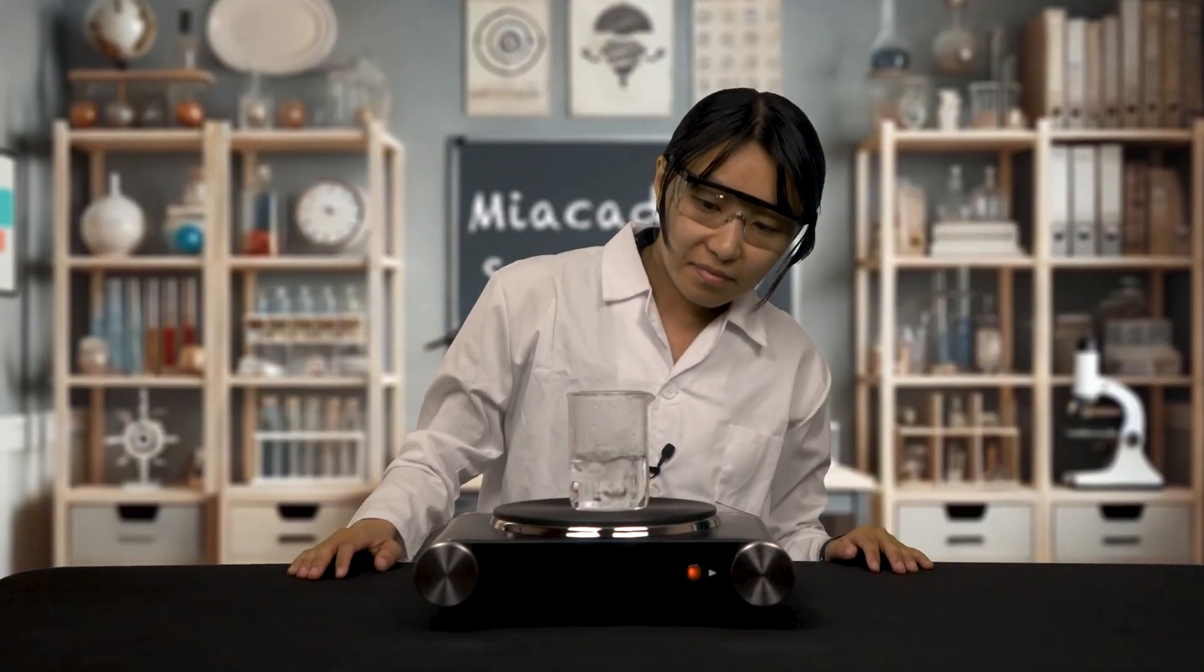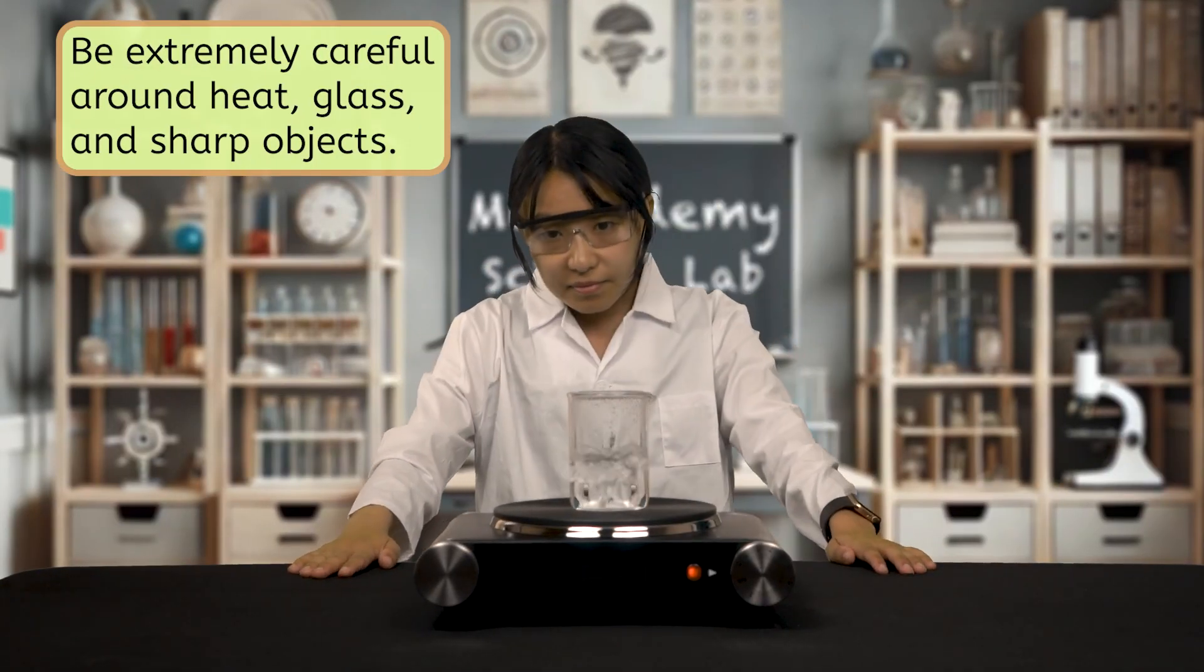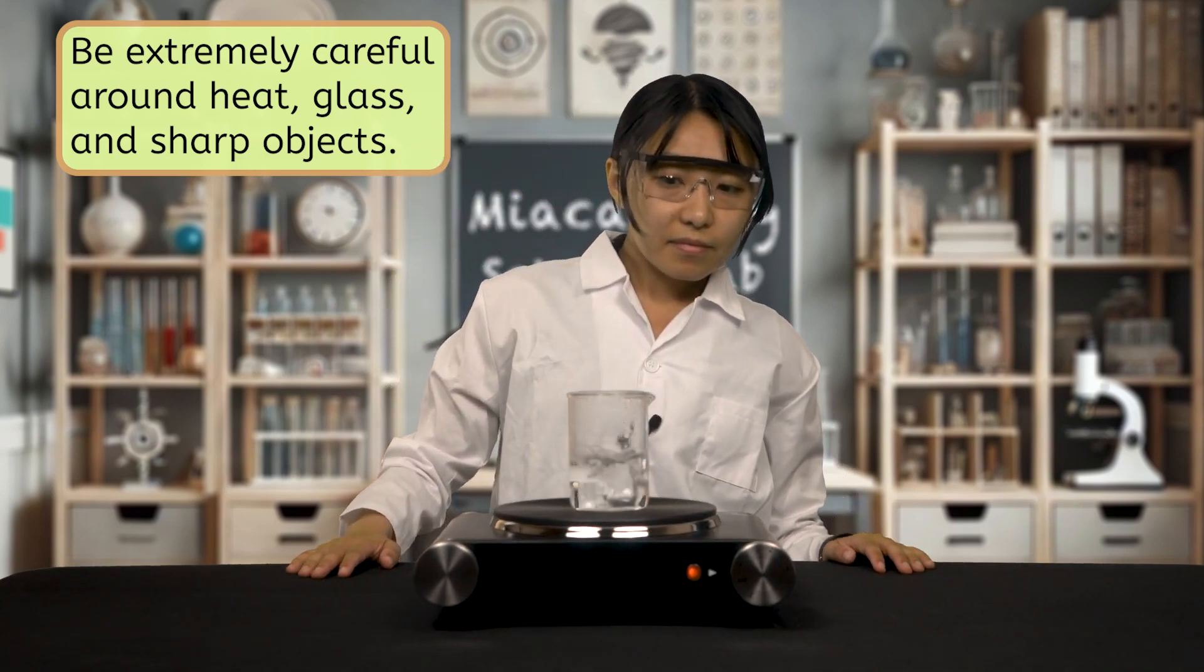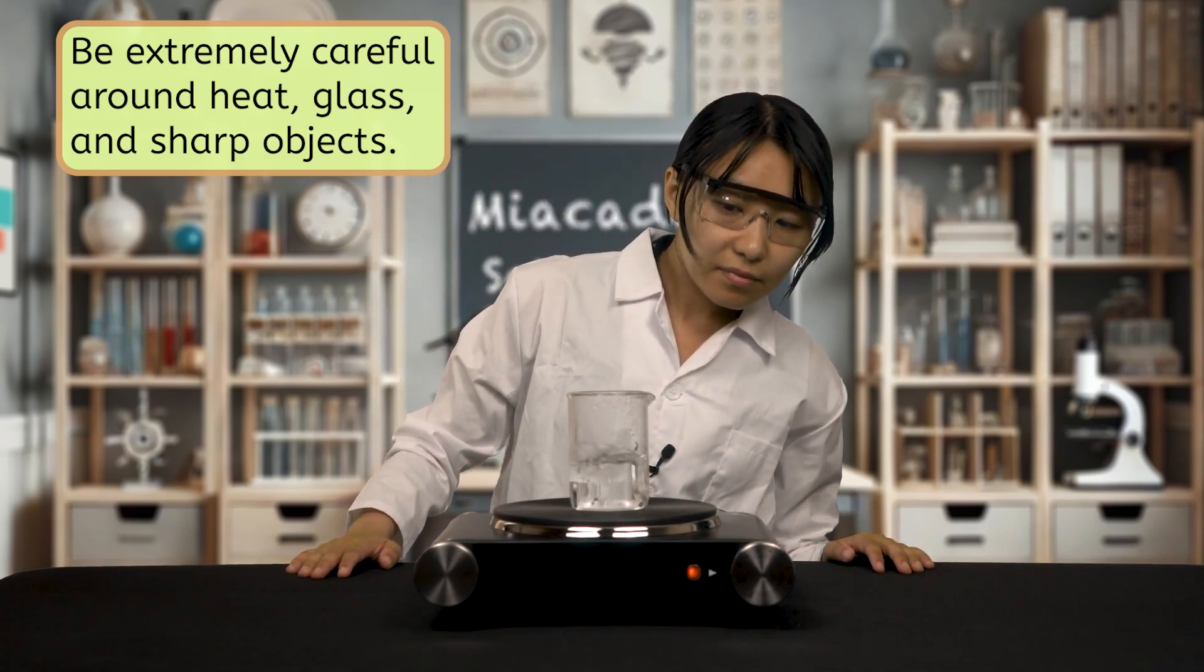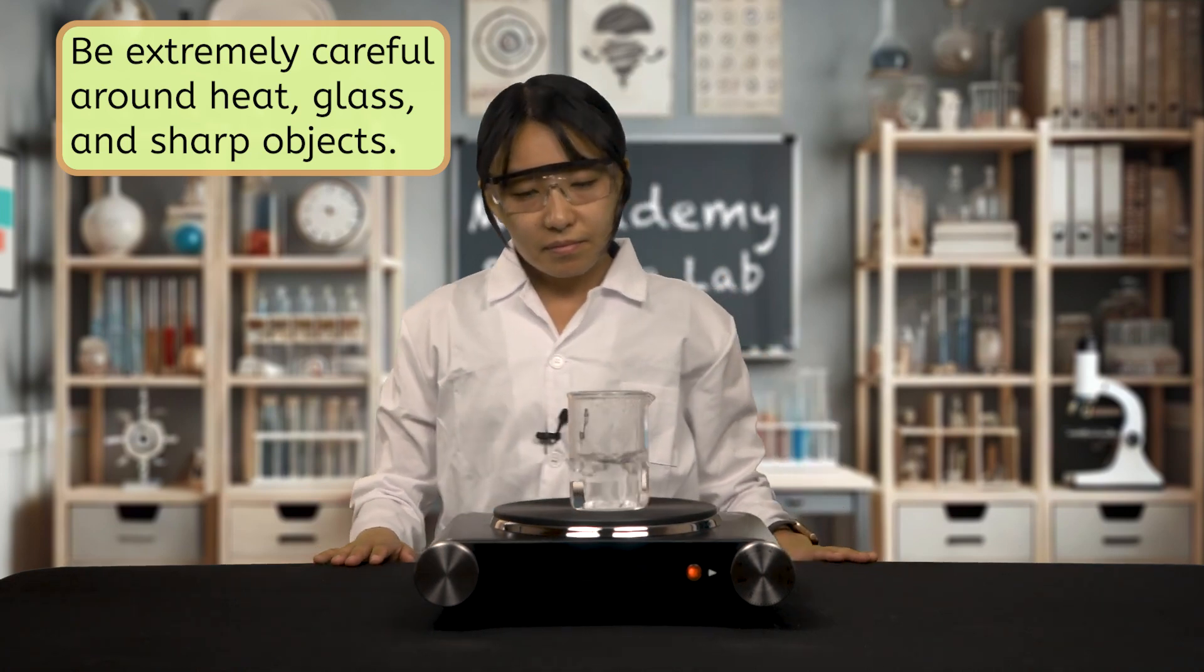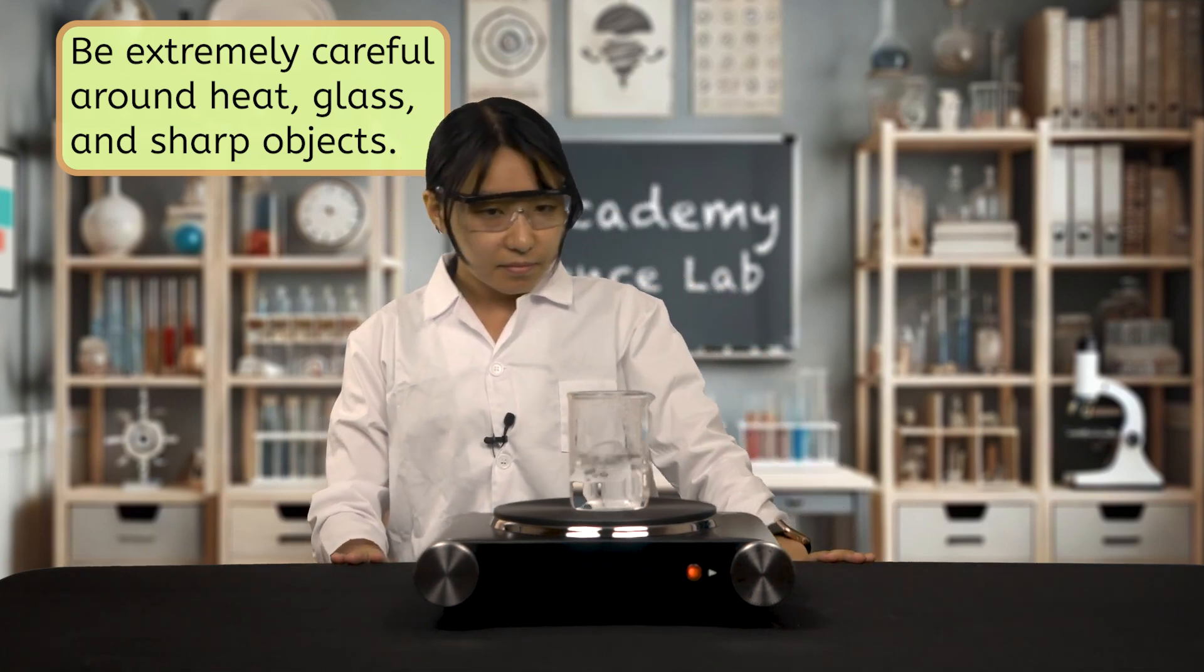Finally, to prevent any emergencies, be extremely careful around heat, glass, and sharp objects. Never leave a flame or boiling pot of water unattended and never look directly into glassware that's being heated. Yes, even if you're wearing goggles. Building these safety habits will help set you up for success as you complete lab investigations. But what happens when you do everything right and an accident happens?